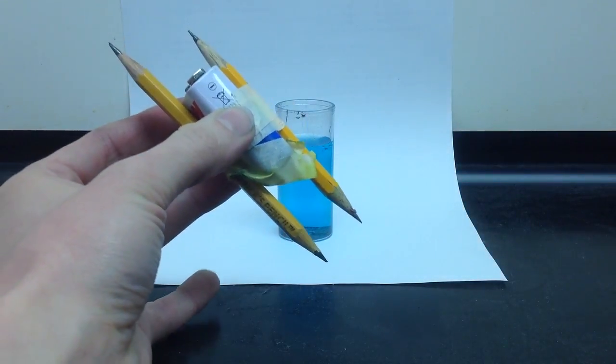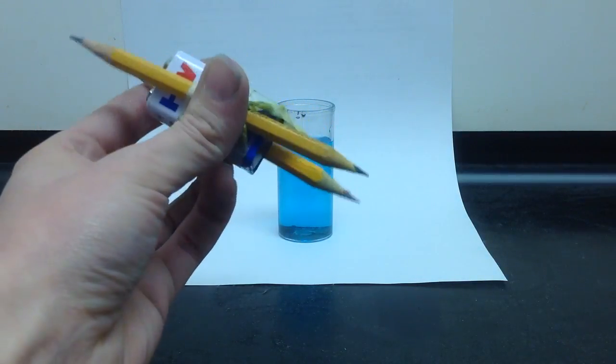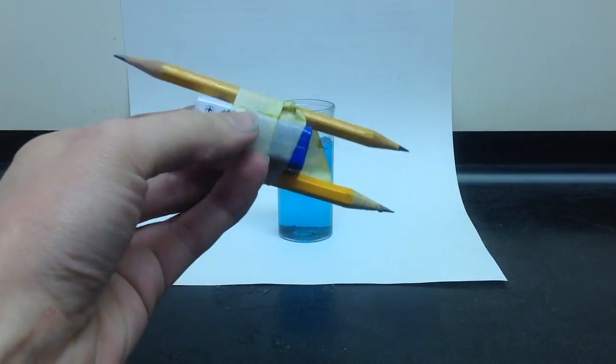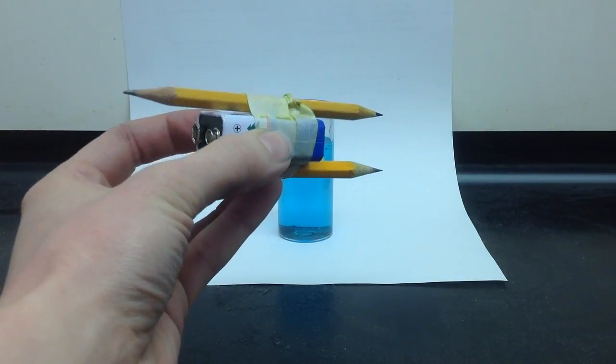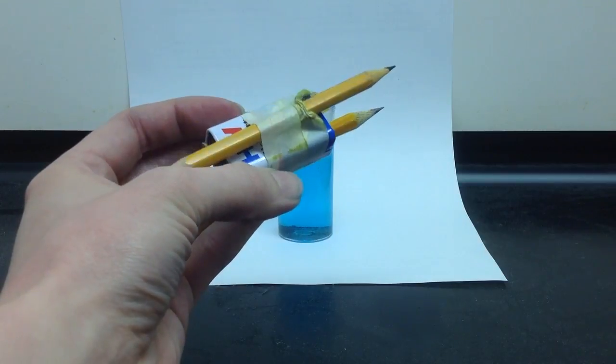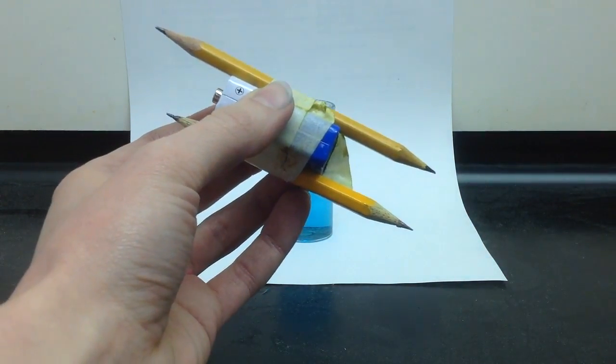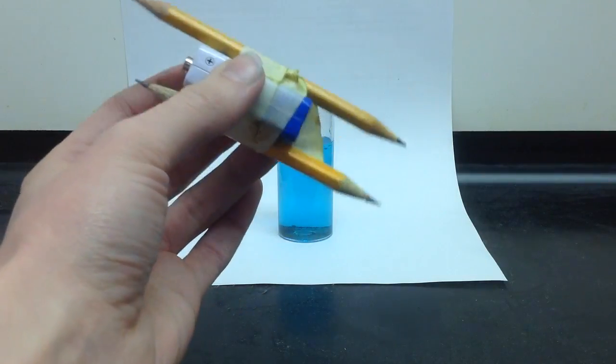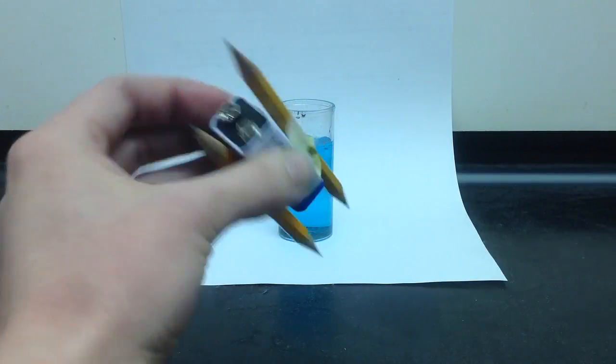So here, I have a 9-volt battery, and it is taped to two pencils that are sharpened on both sides. The pencil lead is an effective electrode, so it's going to help transfer the current from the battery into the solution in order to separate into its components.